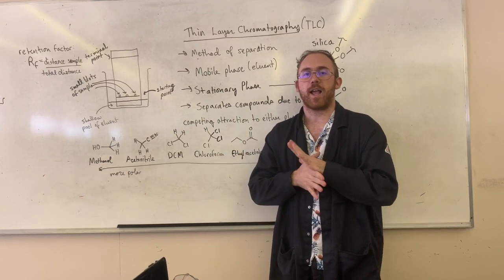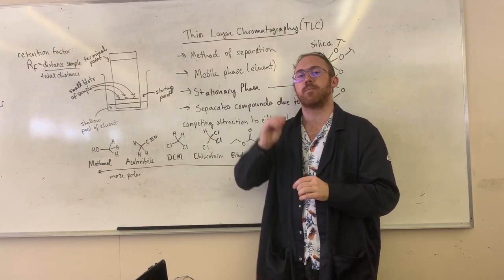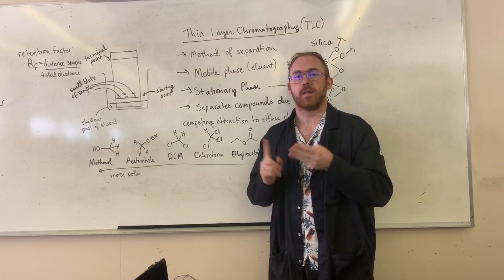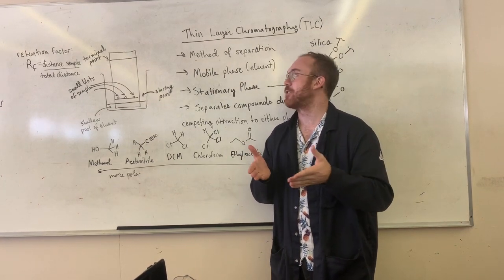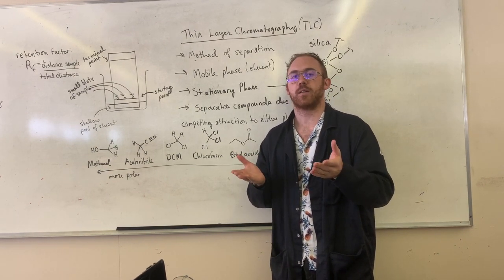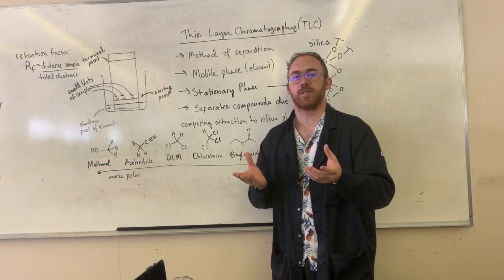So today we're going to actually work with some thin layer chromatography. I'm going to show you how to spot them, how to run them in a TLC chamber, as well as look at their final retention factor, which you'll calculate in order to identify two compounds that are mixed together from 4 known samples that we will compare them to.